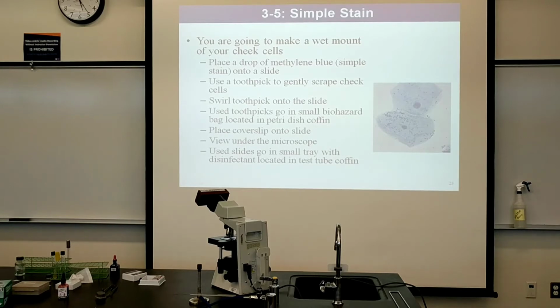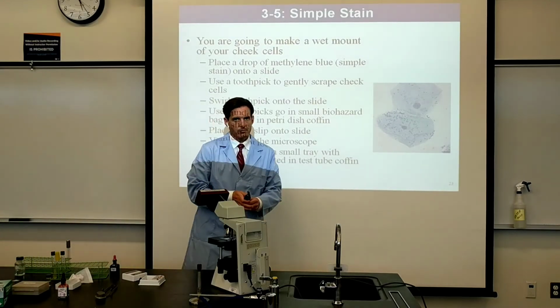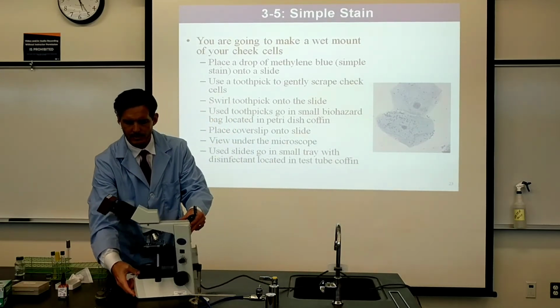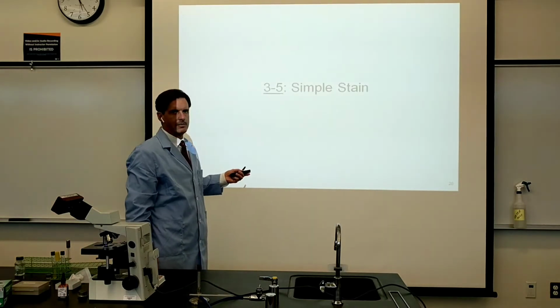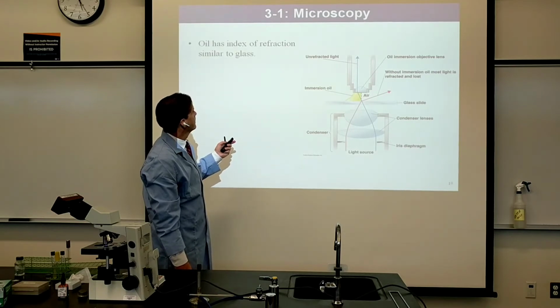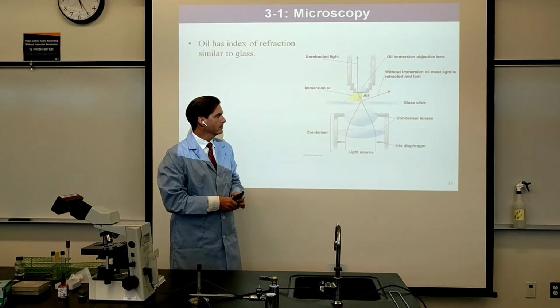So we've looked at our cheek cells under scanning power, low power, high power, and now we're going to figure out how to use the oil. I'll move the microscope out of the way, and let's look for our lesson about how to use oil. So here is the slide about how to apply oil and what the use is of the oil.